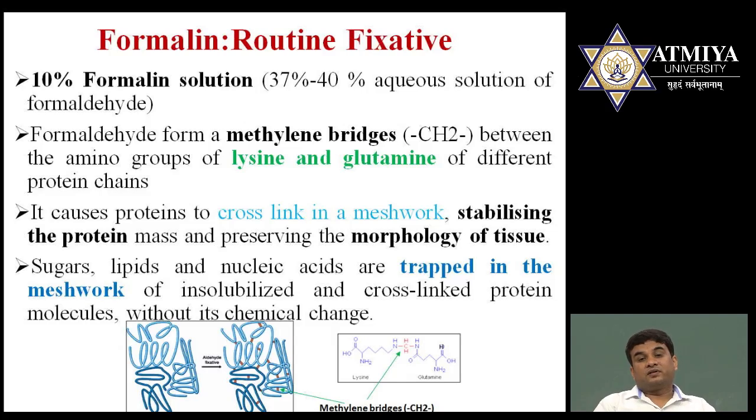Actually, if you are using formalin, you should use it at 10% concentration. In the market, formaldehyde is present as a solution of 40%, and you have to make it 10%. So finally, your concentration of formaldehyde comes to 4% formaldehyde.